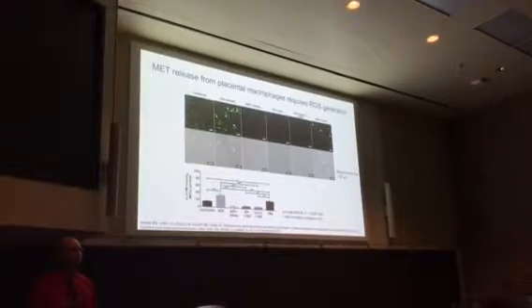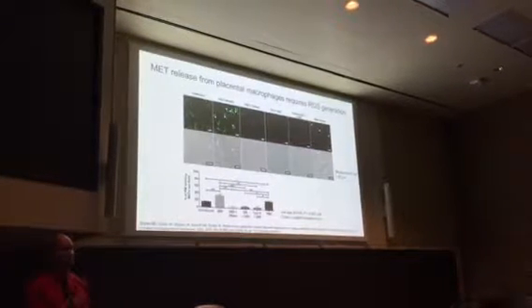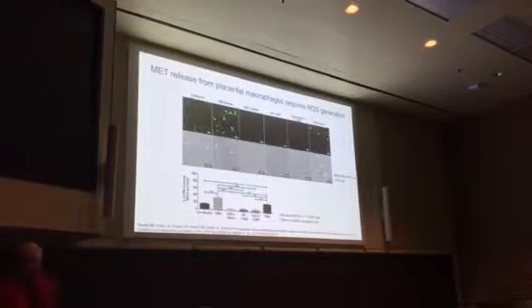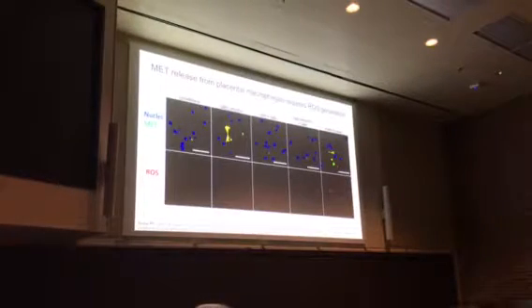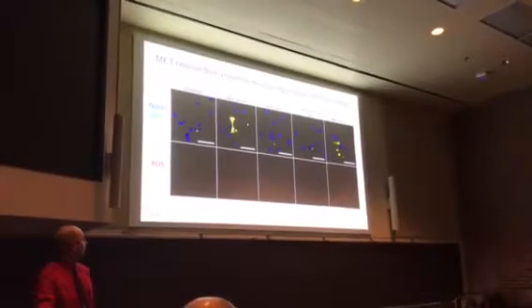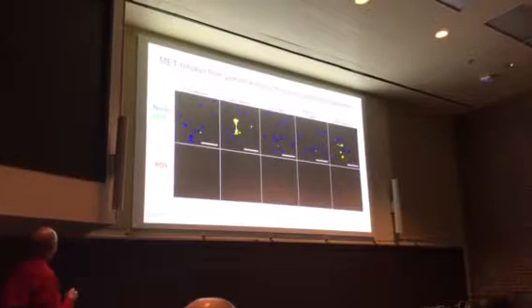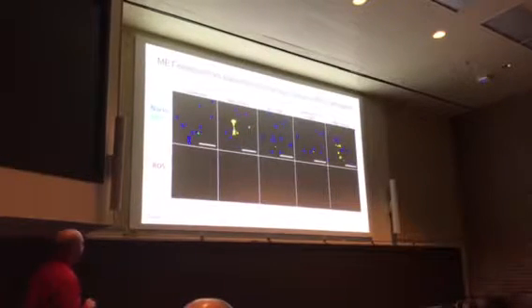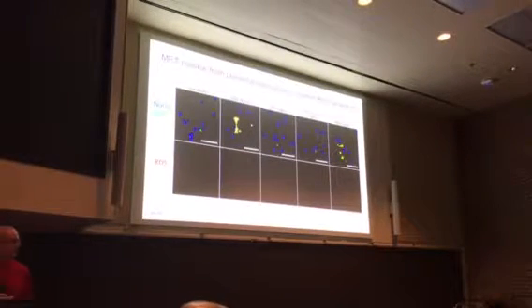Now, if we leave the cells uninfected but treat them with PMA, a protein kinase C agonist that would be likely to drive ROS production, we see a similar response at 1 hour to GBS infection. So let's narrow this down a little bit more. I'm using a fluorescent dye that when it reacts with reactive oxygen species becomes fluorescent. So these are live cell infections. On the top we have staining in blue for the nuclei, in green for our extracellular traps, and then on the bottom just the ROS production so you can see it independently.